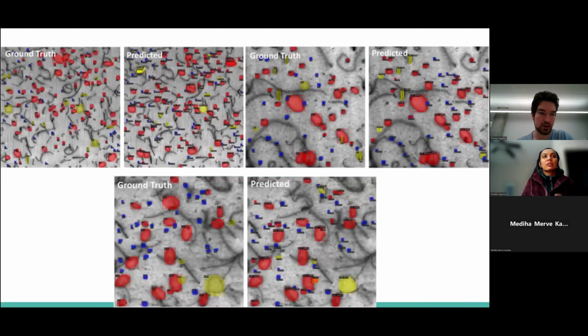I didn't read too much about this in detail, but at least based on what I can hear, there's a ground truth. Yeah, they're providing a bounding box, but it also looks like they're delineating the inside of each defect. I imagine that's probably not done by hand, or it might be. But there's probably simple algorithms you could apply to find the edges of something once you have a bounding box. You can have a microscopist draw a box around it, and then, through edge detection, say, okay, this is the mask of this dislocation loop. Once you have that step done, that might speed up the annotation process. That's kind of what I imagined they were doing. It's possible it's done by hand, but that seems overly tedious.